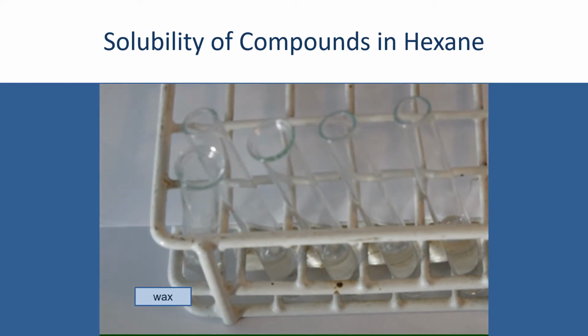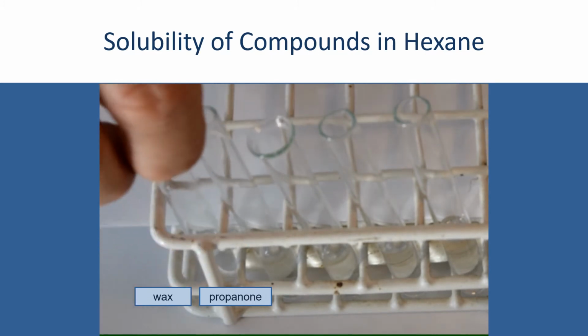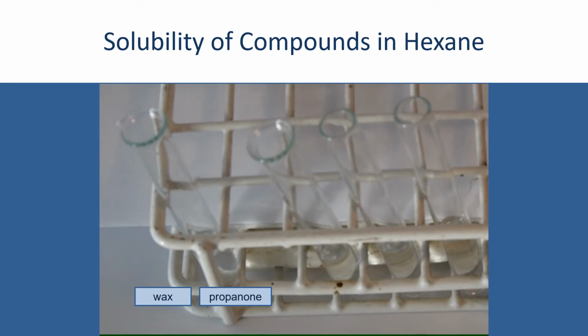Next, I want to look at propanone. Propanone, with its permanent dipole-dipole interactions. I'll put some propanone into the hexane, and you can see straight away there that propanone is completely miscible in the hexane.